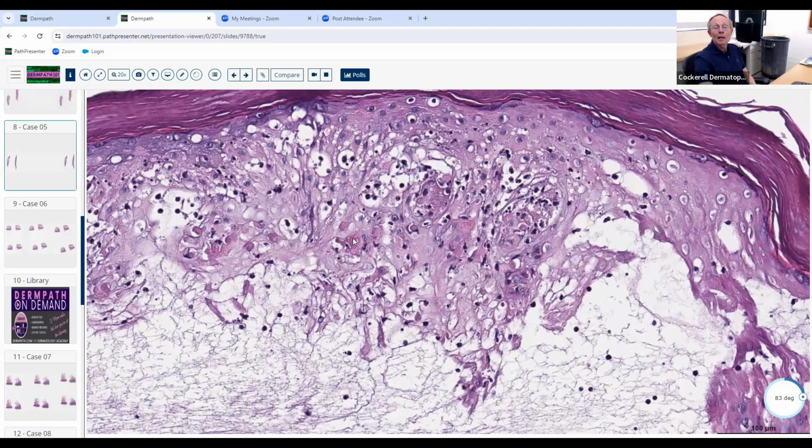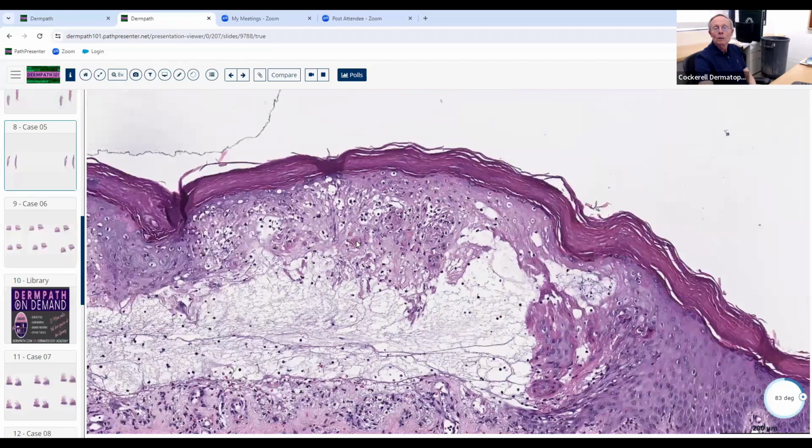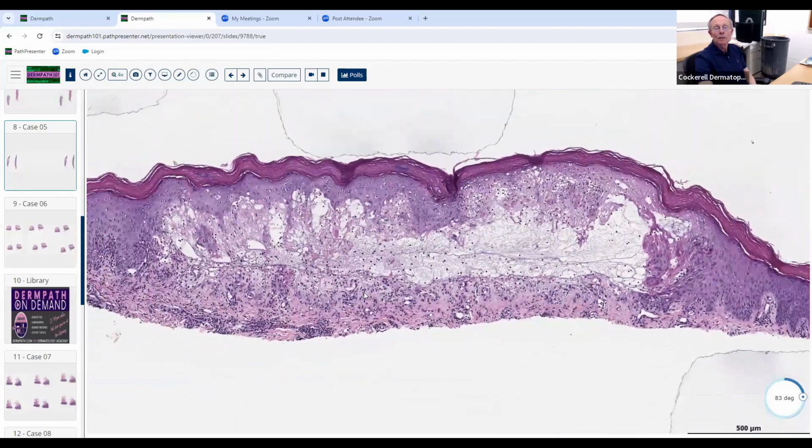If I could go to even higher magnification and transpose one of these adjacent to a molluscum body, they both look pink and kind of similar. When viruses cause these pink inclusions, they all look pretty similar. It's a different morphology, different pattern, but they're always pink like this. So this is really helpful when you're diagnosing one of these conditions.